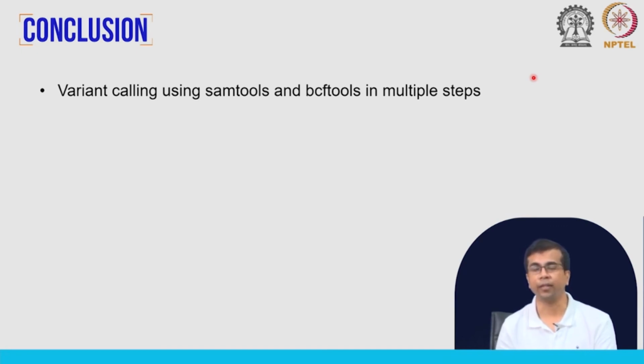It might sound very complex, but once you do it yourself, you will see that each of these steps does something very important, and there are only a few main steps. For example, you have the local realignment and the duplicate marking, but some of the steps that we have done in the hands on are actually preparing the data for those realignment and the final variant calls.